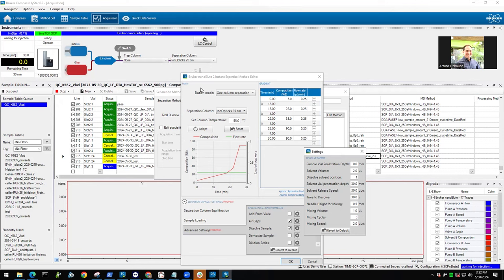How much volume do you need to use? So here I use 2 microliters. For the 384, you want to make sure that you have a large enough volume to also get the things that might have been stuck to the wall. Yeah. And I typically use DDM for resuspending it.